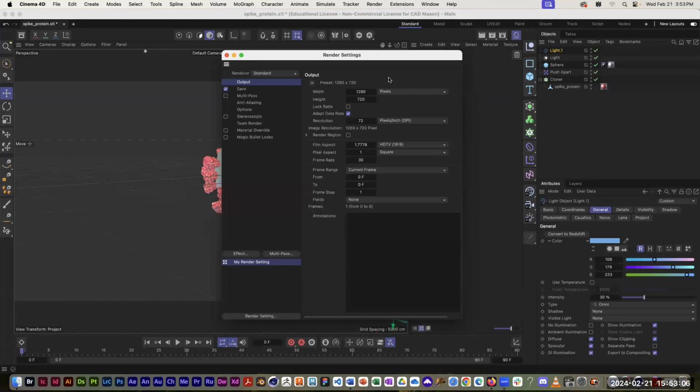For one thing, I want to change the output size because, well, this is kind of buried in the instructions for today's exercise, but similar to the previous assignment or the anatomy assignment, I want something that's 8.5 by 11 at 300 pixels per inch. So we have to tell it to render the image at that size.